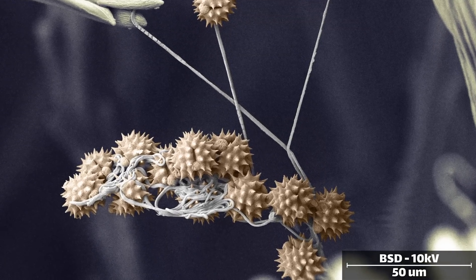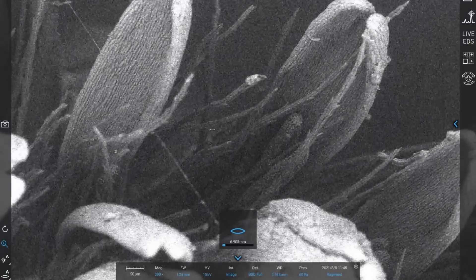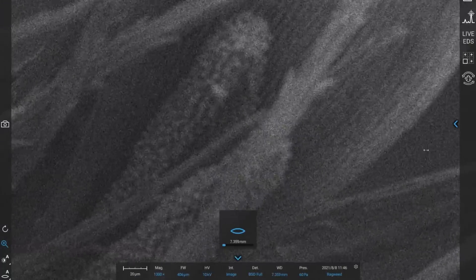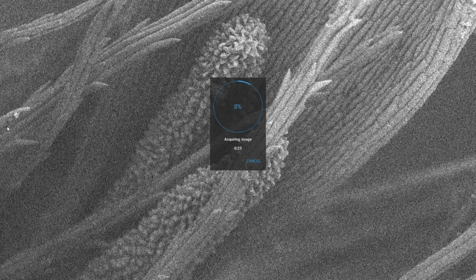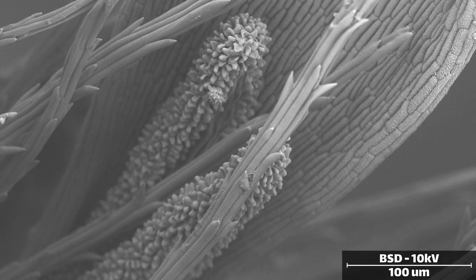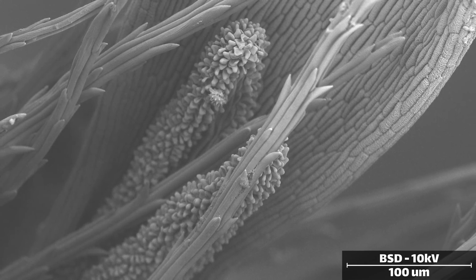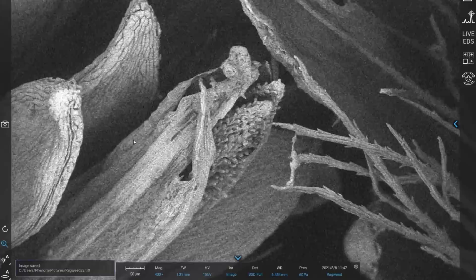I hope this has been an interesting look into the much maligned, but in reality quite harmless, wildflower known as goldenrod. I admit, when I started this video, I was ready to lambast the flowers as the root of all my sinus issues. But after research, I see that I was in fact mistaken, and it's just another beautiful and complex organism out in the wild which deserves our admiration.